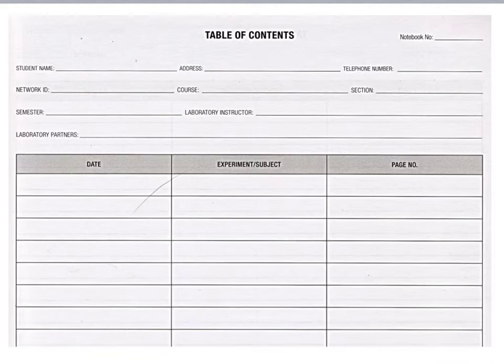All right, so let's start to fill out what it's going to look like. For the first thing, we'll start on the table of contents. Like I said, fill out your name. Make sure that you have it in there so at least it can get returned to you. Then under date, you're going to put the date that you start the lab, and I'm just going to leave it generic right now. Then write the name of your experiment.